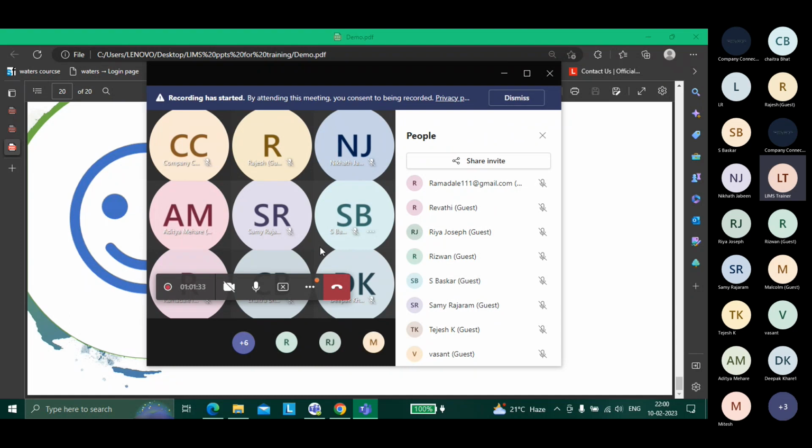Before you get to update result field, you will see certain loops: if else, while, do while. Certain loops are used in all programming languages, right? You need to go to YouTube and understand what a while loop is, what an if loop is, what an if else loop is, what happens if there is an else if, and what happens if only if and else are there. When you make your basics straight, then you go to the back end and try to understand.